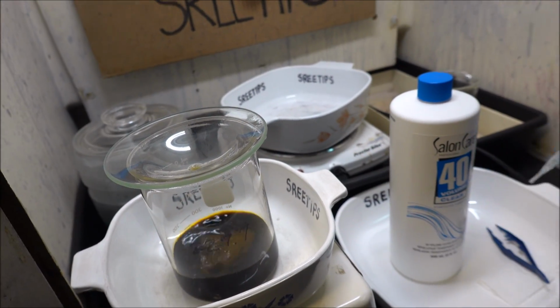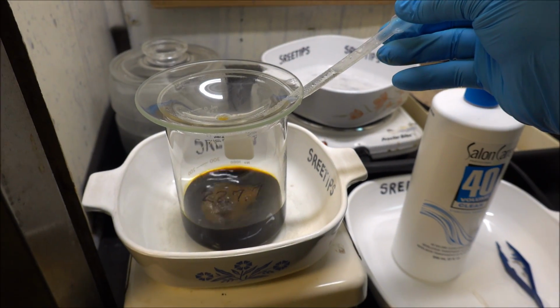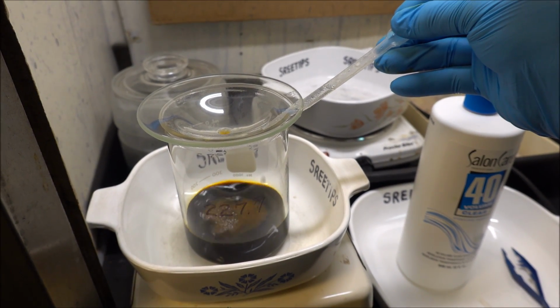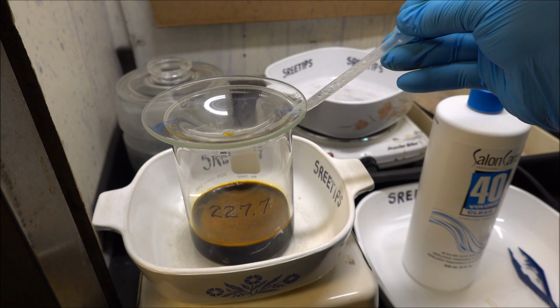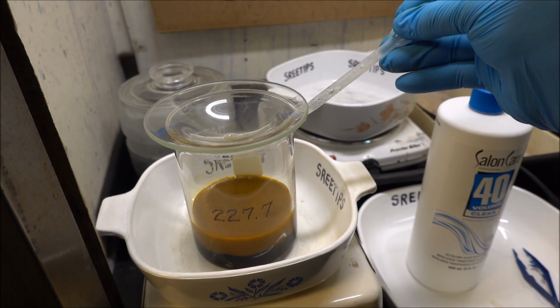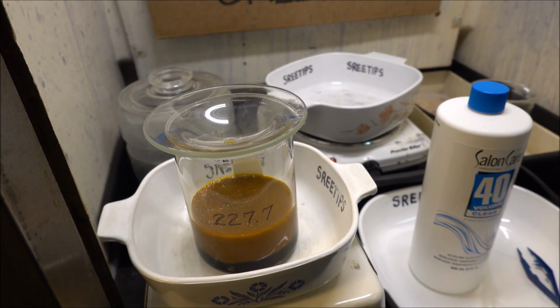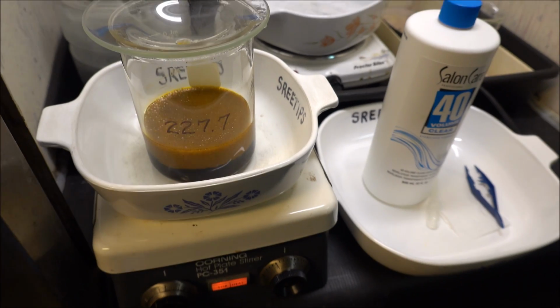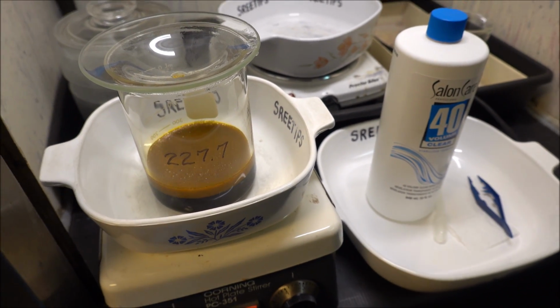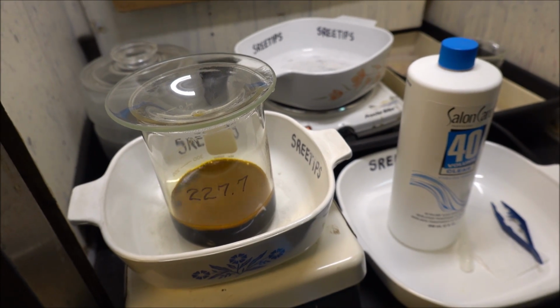Alright, I think we've just about got everything in solution that's going to go here. Still foaming up pretty good when I add that hydrogen peroxide, but I think I've got everything in solution. I'm going to turn this off now and let this cool down. Actually, I'm going to let it spin. I'm just going to turn the heat off here.